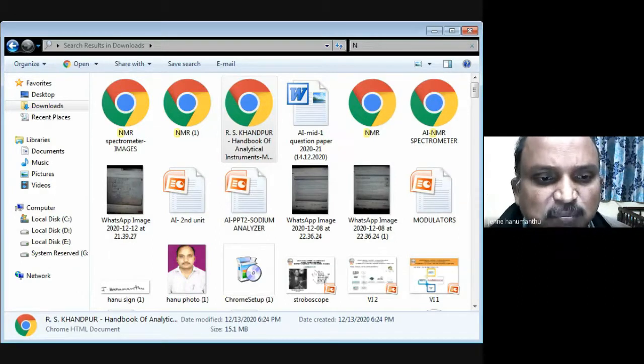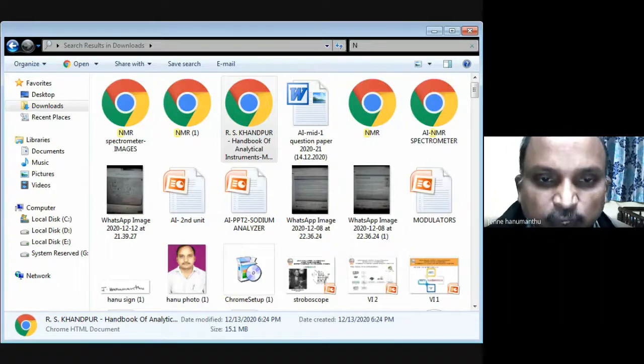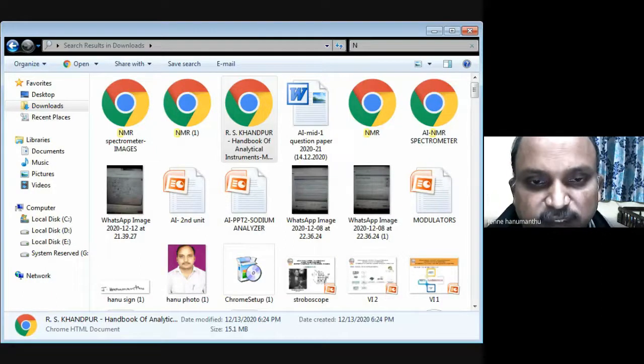See the diagram of the basic ESR spectrometer. In this diagram, what are the instruments? It has a klystron, an attenuator, a circulator, a magnet, and a cavity. Within this cavity there is the unknown sample. From the circulator, we are giving some diode detector and an ammeter, which measures the unknown currents.